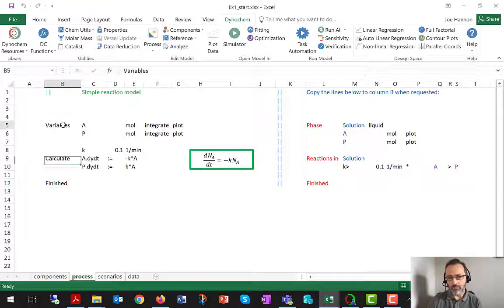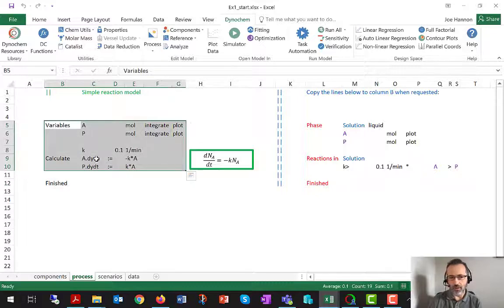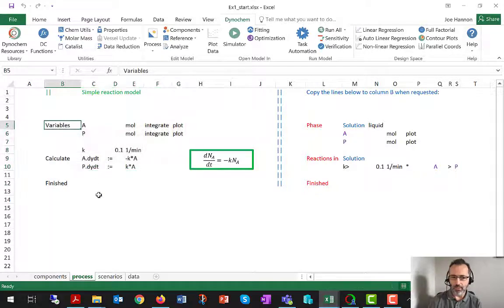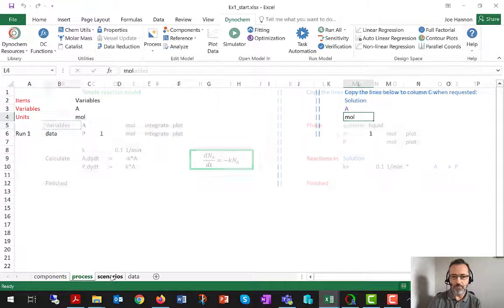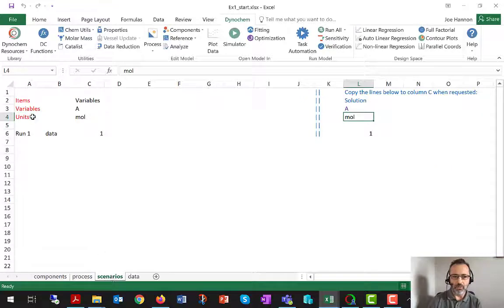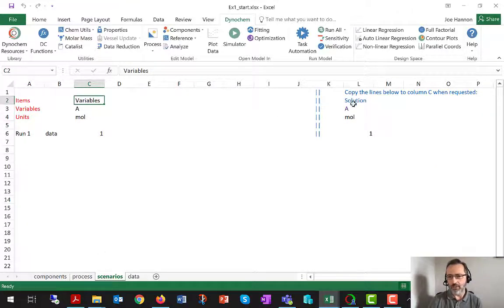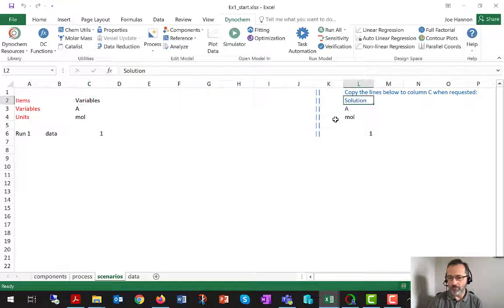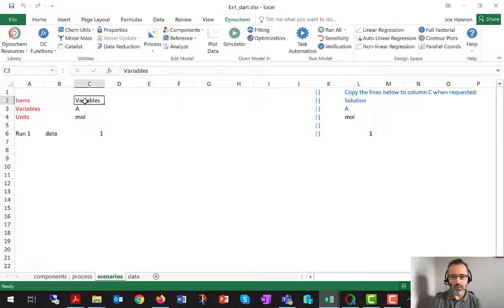That's the process sheet, how it looks when we've got a model that consists entirely of user-defined variables. The scenarios sheet, the main difference between this and scenarios, if we were using the full Dynachem statements, is instead of the word solution as the top row in the header, we're going to have the word variables, because everything in this model is a user-defined variable.